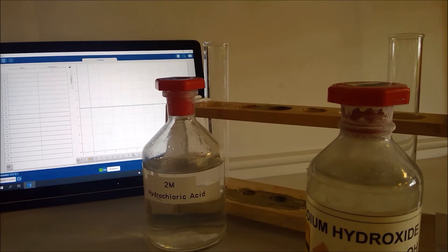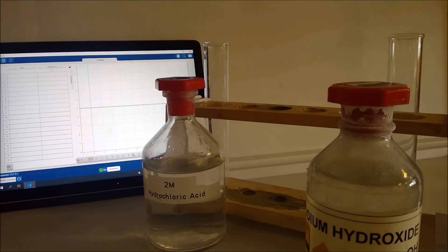During our experiment here we're going to have a look at the reaction between hydrochloric acid and sodium hydroxide solution in part A and look at the temperature change we can observe during this reaction.